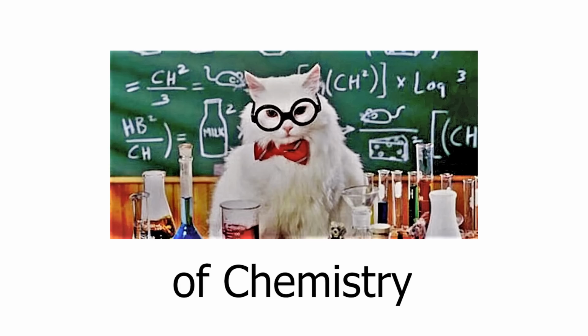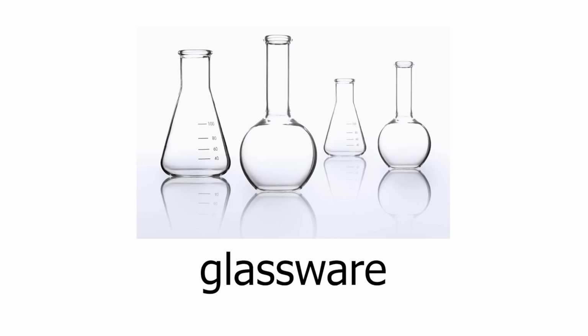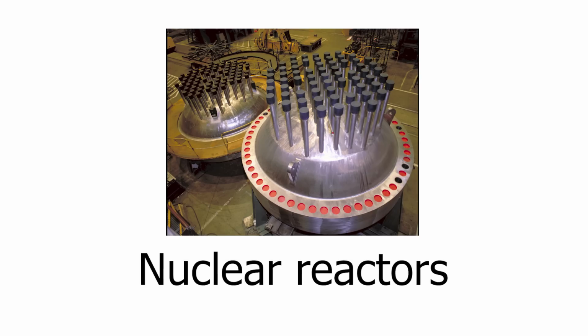Sodium borate is a salt of boric acid, which is an acid of the element boron, and with the power of chemistry it's possible to turn this unassuming white salt into a versatile metal which has uses in glassware, aerospace, and even in nuclear reactors.